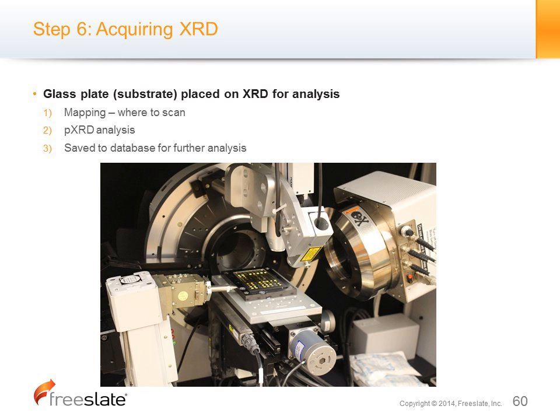So now we move the plate, which you can see here. As you can imagine, all these pictures are not from the study itself, and the plate on it is a different plate, but the idea is absolutely the same. You pretty much put the plate on top of this Bruker XRD, and you have the camera. There's a camera on top that will eventually map each well.